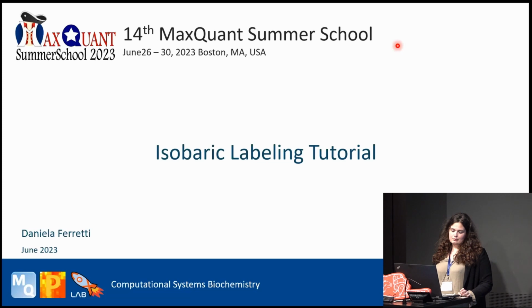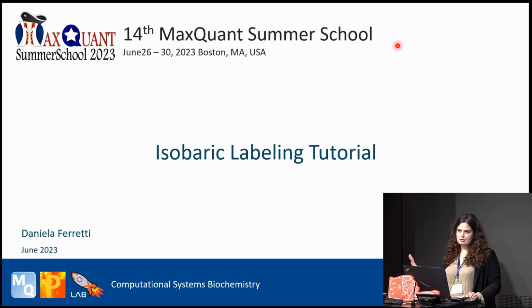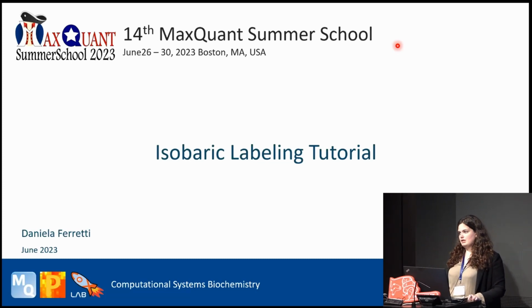Before starting, I would like to say something. You will see that I will show you through screenshots, because this tutorial, compared to the tutorial that you saw during the morning, is not only done in Perseus, but we will go from MaxQuant to Perseus. So I will show you how to run the isobaric labeling from MaxQuant, then get the output, and from the output analyze in Perseus. I will do this through slides because I tried last year to do this practically altogether, but we realized that it was too long to do both of them in 1 hour.